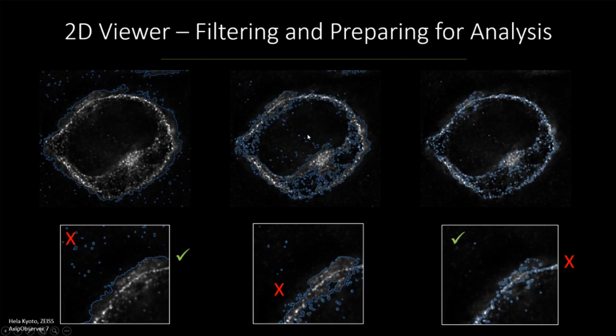You might be asking yourself, well, why would you try to grab the cell based on a stain like this? The reality is we just don't always have the luxury of using exactly the histology that we want. A lot of times we're looking at the data later on and we think, oh, I have a great idea. If I can grab this cell, then I can do some kind of cell-by-cell analysis. You're thinking after the fact, what can I do to get the most out of the image, right?